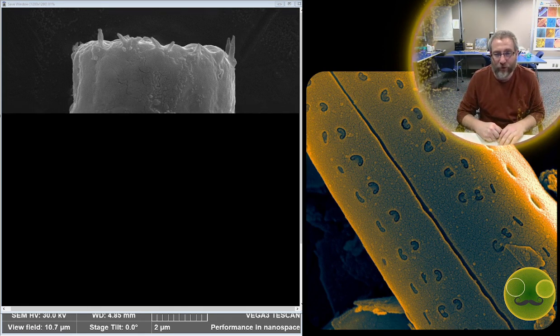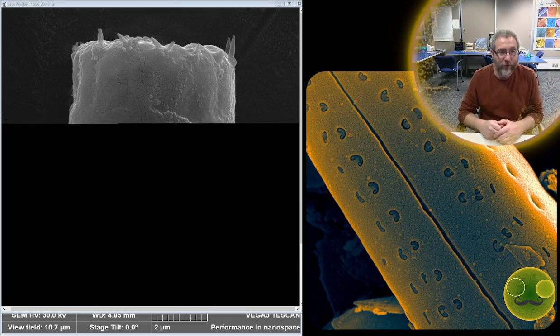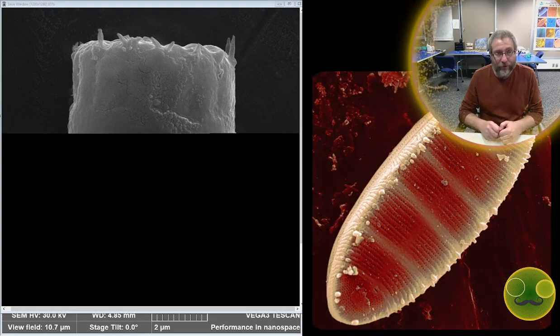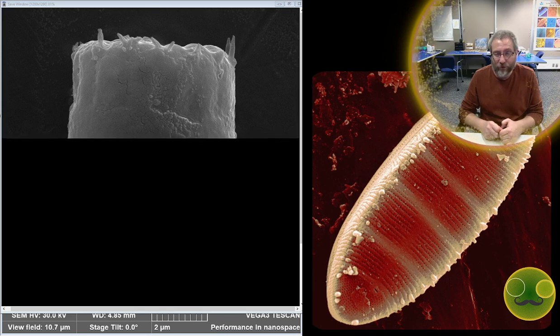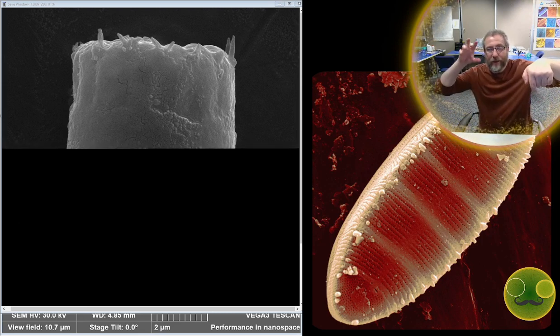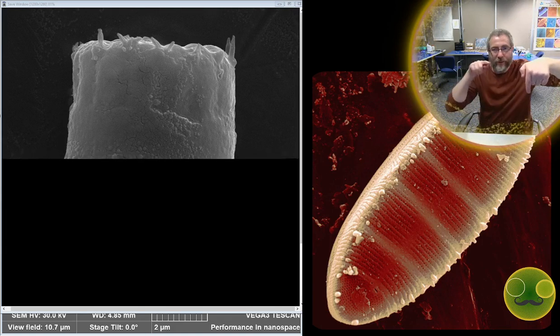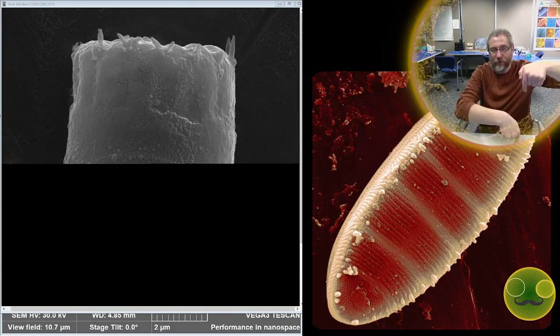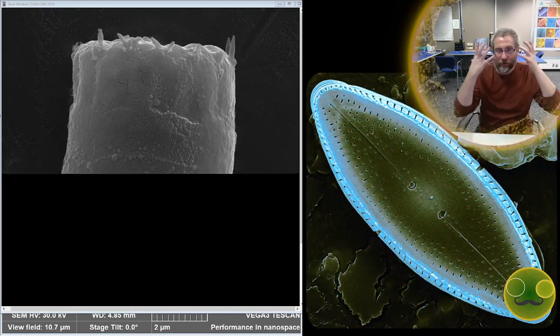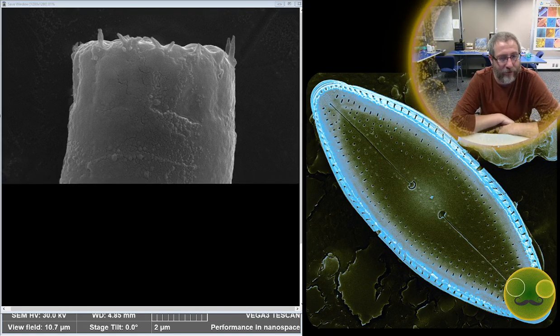And there are microscopes that function that way, where you would look at reflected light, usually for high-powered light microscopes. They have something called a Smith reflector, which is basically like a mirror. The light housing is on the top, and the mirror lets the light be fired down onto the specimen, and then the path goes off of the sample and back up into your eyes, so that you can see some of the surface structure, but it still doesn't look quite like an SEM.